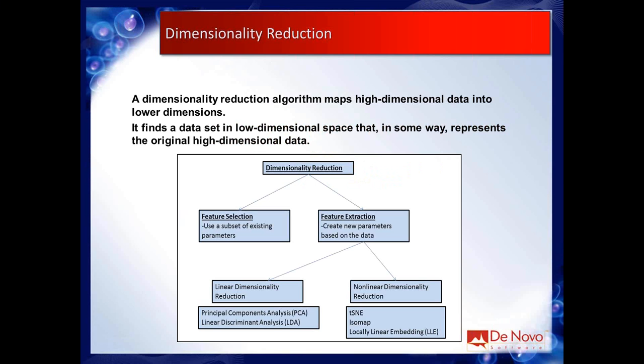There are different ways that people do dimensionality reduction all the time. Feature selection is one major way of doing it, and a lot of people do it manually using their biological background knowledge to say, well, I know that the information I'm looking for is actually all able to be visualized in these two parameters, so I'm only going to show these two.